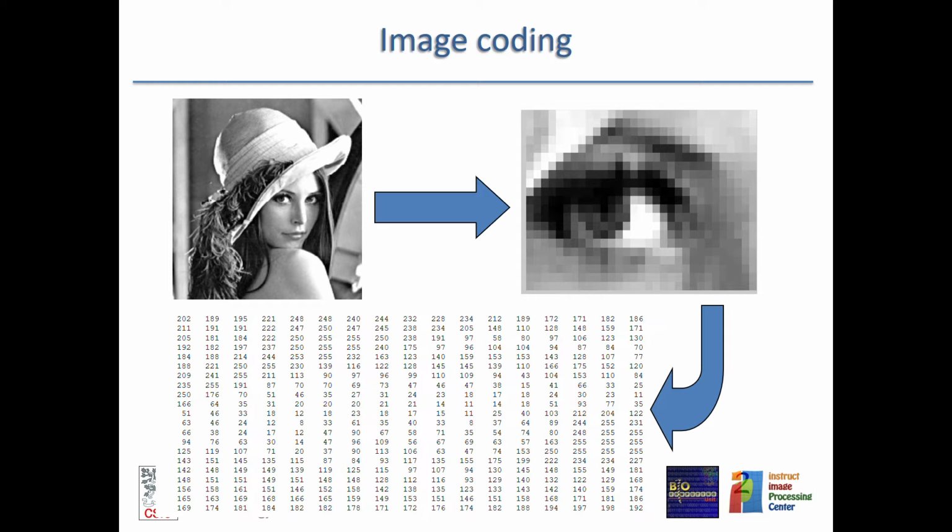It is just a matter of convention of what values we keep in the images. But what is important is that in gray images every pixel is represented by a single value, so an image is at the end a matrix of values.